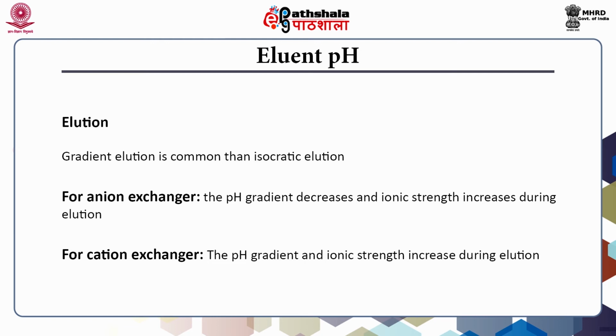That means they will lose their cationic state and enter into the neutral or anionic state, so that on the cation exchanger the proteins can be easily replaced with other positively charged ions, generally in this case sodium ions. So, let us see the procedure of ion exchange chromatography in the next slide.